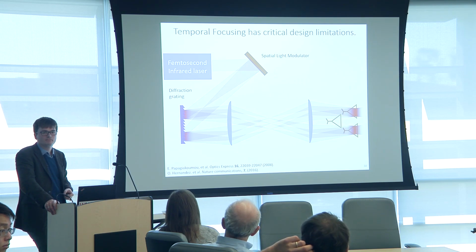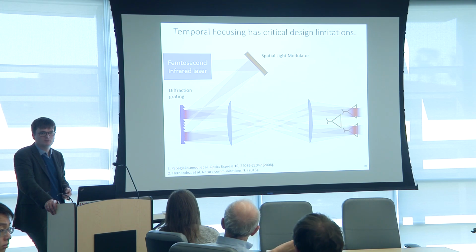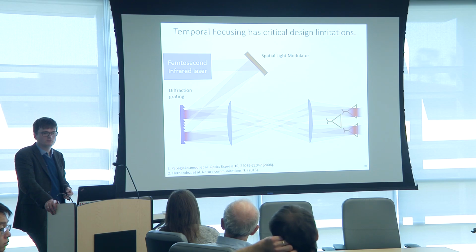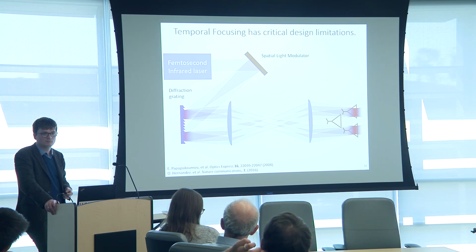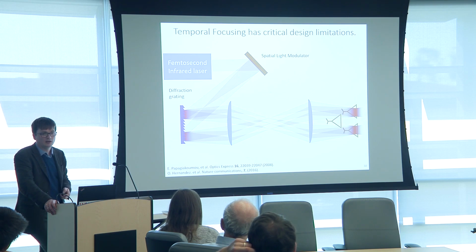Maybe a very naive question, but at least in principle, if you had information about the geometry of your diffraction grating, would you be able to create a hologram that is able to perform temporal focusing at 3 different spots? If you know. Yeah, in principle.